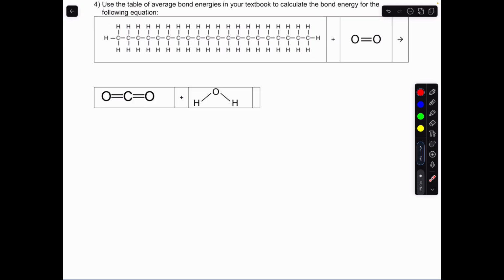However, one of the disadvantages of our system is that it wasn't well insulated. It had a lot of holes, and so there was a lot of room for heat to be conducted into the surrounding air and lost by the system. So I think our calculated value will be quite a bit less for the experiment than using the table of bond energies.